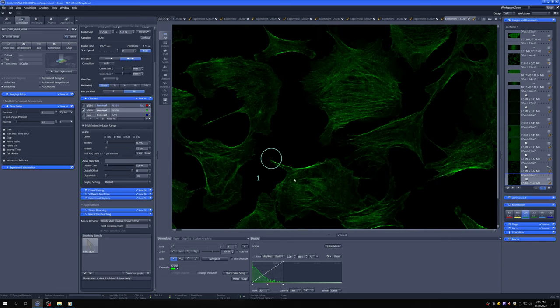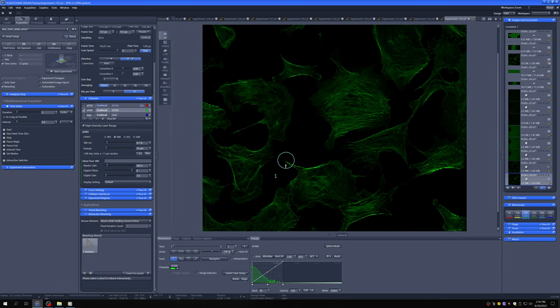I would be in a situation where if the cell is crawling around, if I set this here, start the experiment, by the time it bleaches this may have already moved. So you may want to do this interactively.